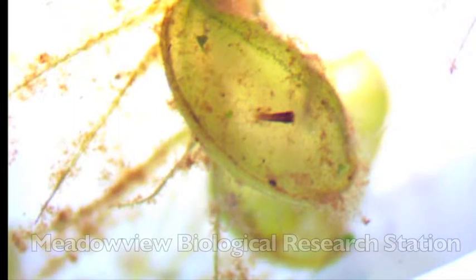Unlike the Venus flytrap though, Aldrovanda is an aquatic plant and traps are only 2 to 3 millimeters long — just big enough to capture the smallest tadpole, aquatic insects, and other microorganisms.